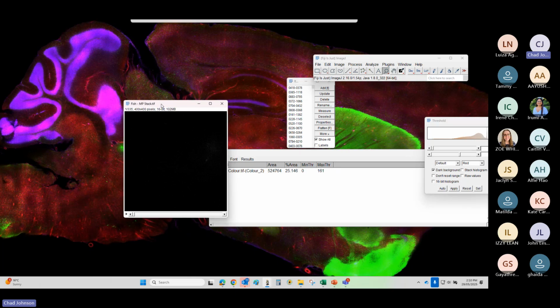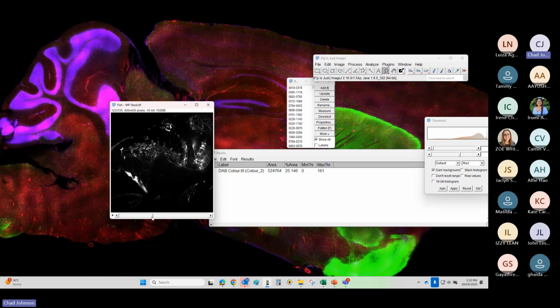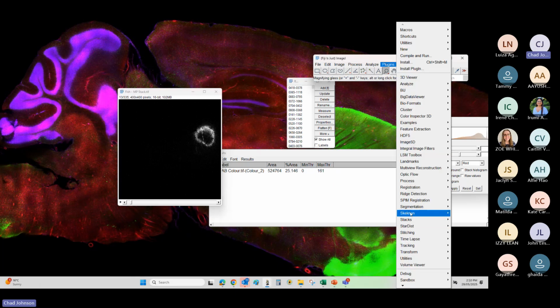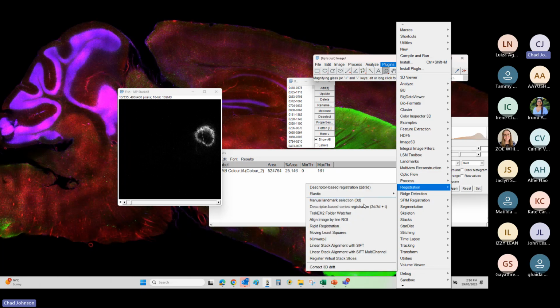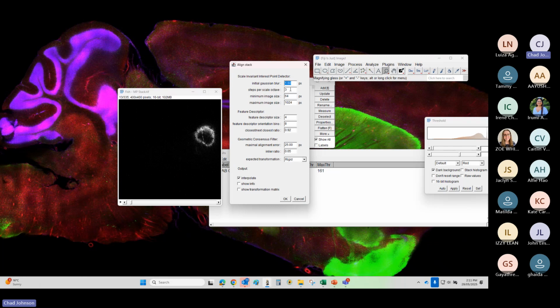This is exactly as it sounds. It is a multi-photon image of a fish. If we zoom through, we can see all of the sections. At some point, the fish moves. You see the fish moves while it's being scanned, and that's a bit annoying. There's a little bit of movement there as well. This is a live fish, so we don't have to put up with that. We can align that using SIFT. So if I go into plugins, registration, SIFT, most of this stuff you can ignore.